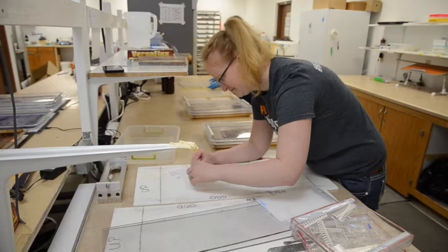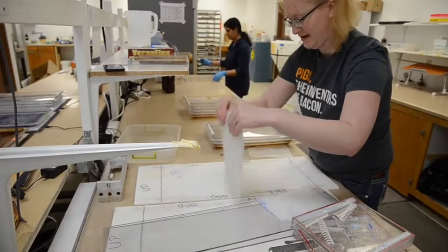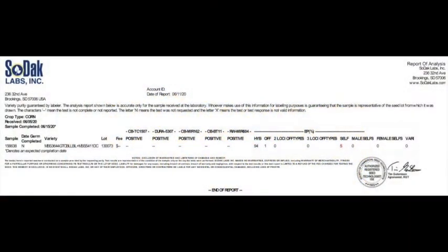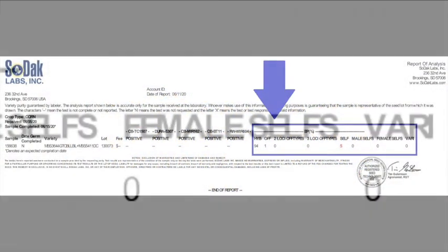Sodak Labs uses starch gel electrophoresis to stain and identify isozymes to determine the genetic purity on 96 seeds, with the purity level determined by subtracting the percent off types and selfs found in each sample.